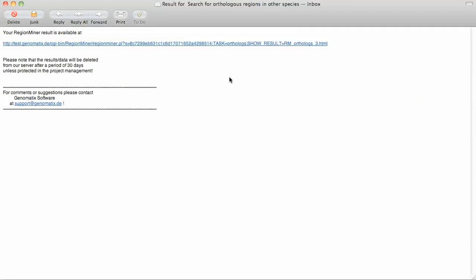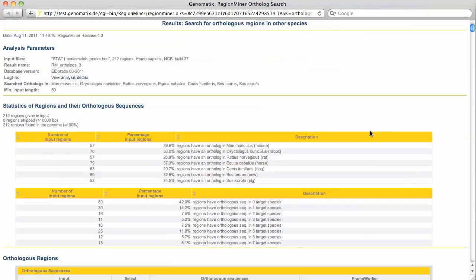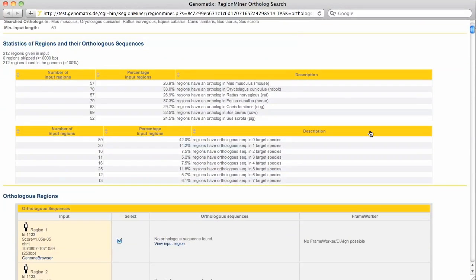Now here's my result. Let's have a look at it. First, we get some statistics as to how often an orthologue was found in each organism and how many orthologues were found per region.